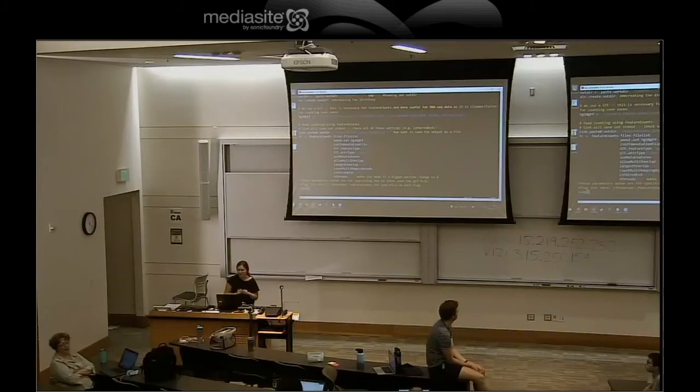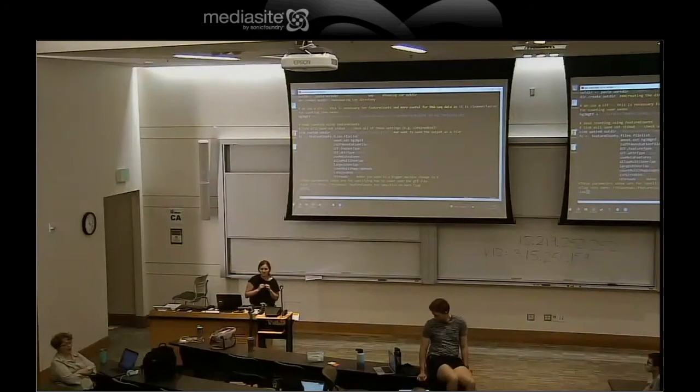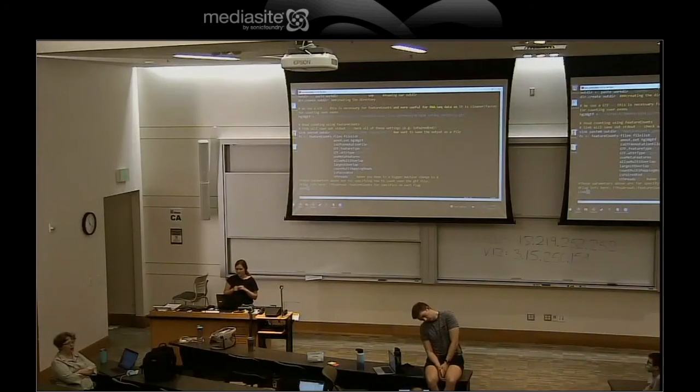So this is a little weird, right? Because you guys are working in R live. But it turns out you can make an R script, and if you have it set up correctly, you can run it with sbatch just like you've been running every other script. You do it a little bit weird because you make an sbatch script that runs R that takes in the script. But we will show you how to do that tomorrow, because the first step is writing your script, which is what you guys were learning about today. And tomorrow, you're going to learn how to run an R script on a supercomputer.